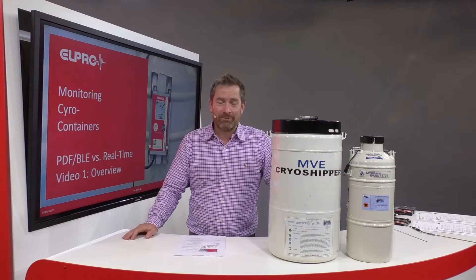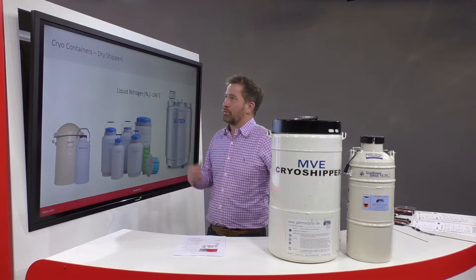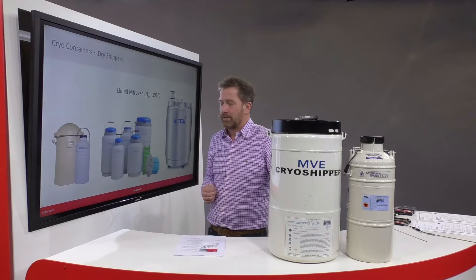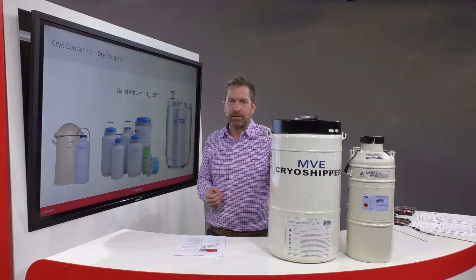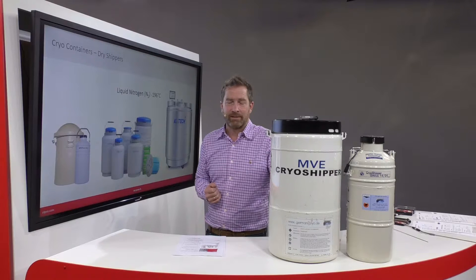Welcome to this video series on monitoring cryogenic containers, also called dry shippers. There are many different sizes available, from a few cubic centimeters to many hundred liters. They all work in the same way: they're filled with liquid nitrogen, which keeps the temperature at negative 196 degrees centigrade.